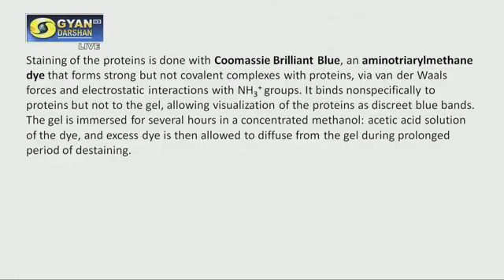Now you stain the proteins with one stain, that is Coomassie Brilliant Blue. This is an amino tri-aryl methane dye that forms strong but not covalent complex with proteins via van der Waals forces and electrostatic interaction with the amino groups. It binds non-specifically to the proteins but not to the gel.